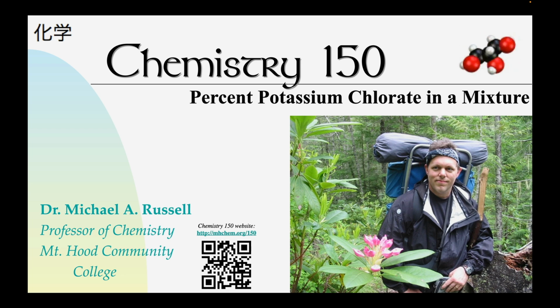We'll also see how chemists can figure out the percentage of an active ingredient when there's other, not as exciting components in your mixture. So let's see what this lab has to offer.